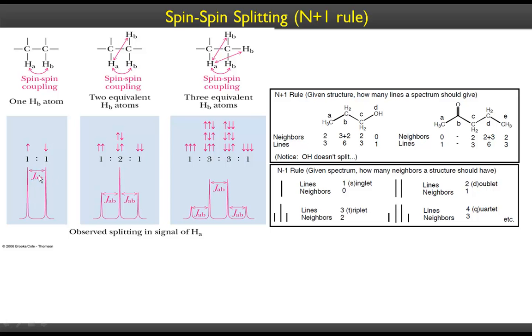Okay, the coupling constant is proportional to the dihedral angle, and to the extent to which the neighboring nuclei couple. So this hydrogen here has two neighboring nuclei. Because of that, they are oriented in three different ways, so we get three peaks for this hydrogen, and this is called a triplet, and they are in a 1:2:1 ratio, the intensity of these peaks, and the distance between those peaks is given by the coupling constant.